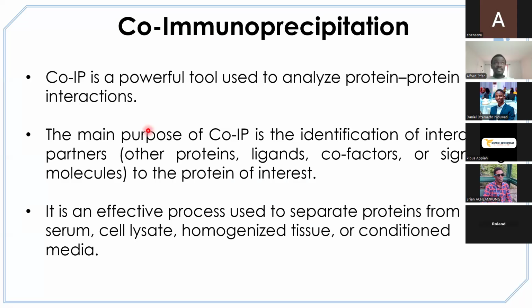We believe that, let's say, in a particular tumor tissue, protein A is interacting with protein X, which is making the disease more able to metastasize into other tissues. That's your hypothesis. You believe that breast cancer tumors have these two proteins that are interacting, and that's why we are seeing the aggressiveness of this particular condition.